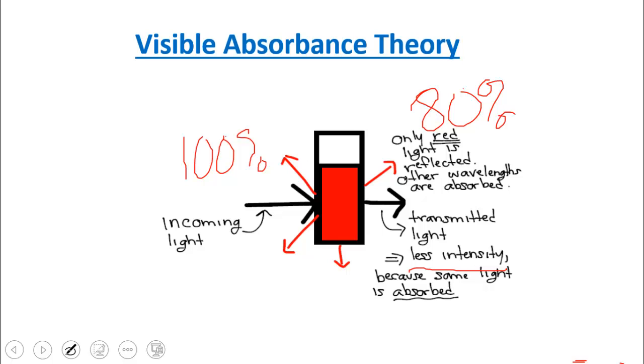We could either look at the percent transmittance, how much the amount of light being transmitted through the sample changes, or in our case, we're going to be looking at absorbance. Essentially, as the light comes through our salicylic acid iron complexes, these colored molecules can absorb some of the radiation.